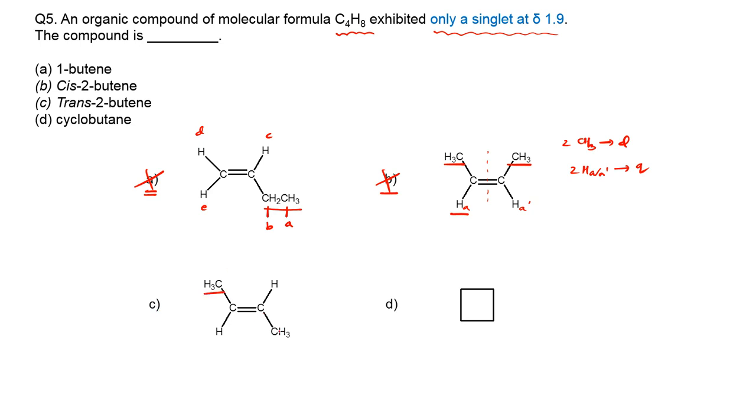In compound C, again it is the same. This is a compound that has symmetry, and these two CH3s are equivalent. So again, these two CH3s will give a doublet, which is not expected from this. So this can be easily ruled out. Such problems we can rule out by just looking at one of the absorptions. In this case, since this CH3 will give a doublet, which is not expected in the compound, that will get ruled out.